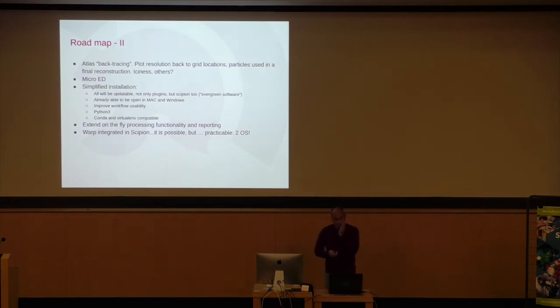And additionally to that, we are working on an Atlas plugin that will backtrace your results to the Atlas. This would probably be useful to plot resolution based on the location, plot ice thickness, maybe plot particles. There was a tweet from Matt, and I asked him if we could steal his code. He was happy to contribute.